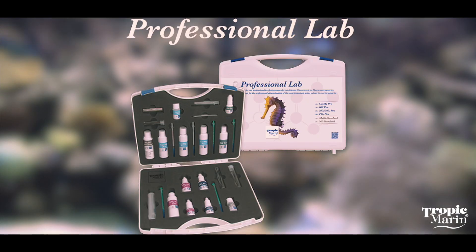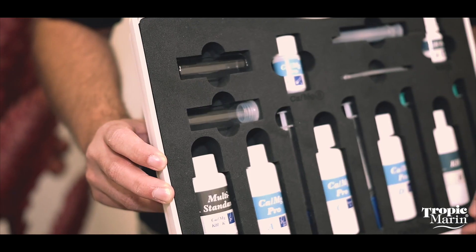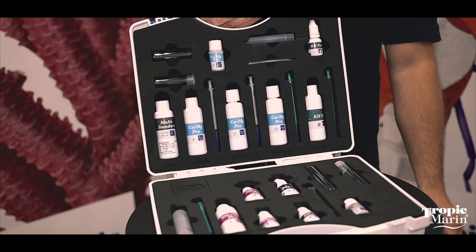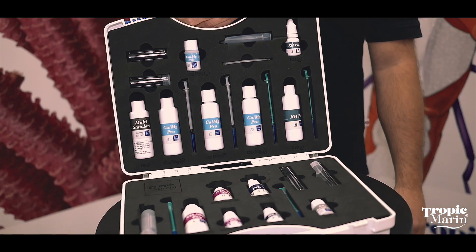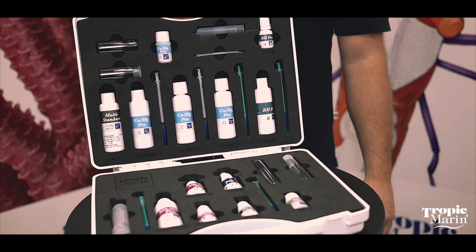Now we have the Professional Lab. The Professional Lab comes in this carrying case — it organizes everything for you. It includes the Calcium Magnesium Pro Kit, the KH or Alkalinity Pro Kit, the Nitrate Nitrite Pro Kit, and the Phosphate Pro Kit.